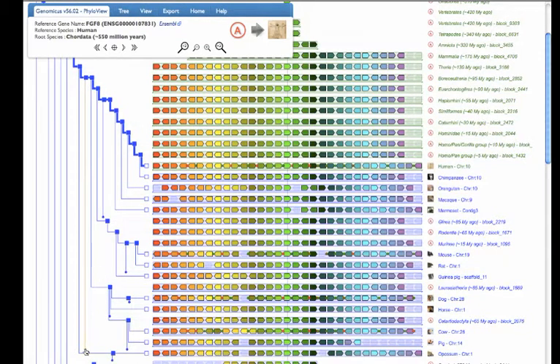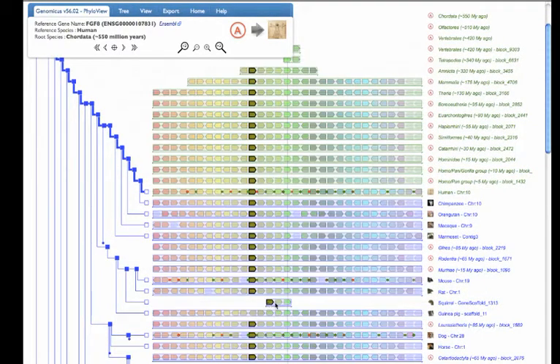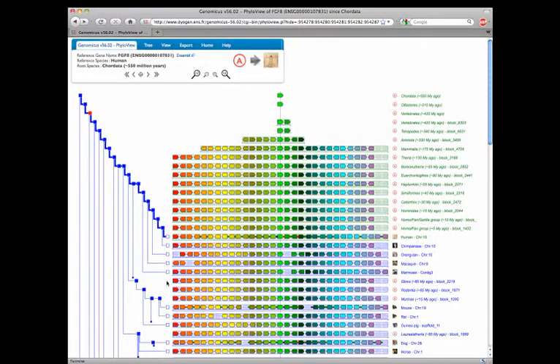Now, some branches end with a small blue circle to show that some data is hidden there. For the moment, these correspond to all the low coverage species. For instance, here for squirrel. If I'm really interested in squirrel, I can restore its branch by clicking on the blue circle, but the FGF8 gene is indeed on a very small scaffold where there are only 3 genes, so I will keep it hidden. Now I zoom out in the browser window.